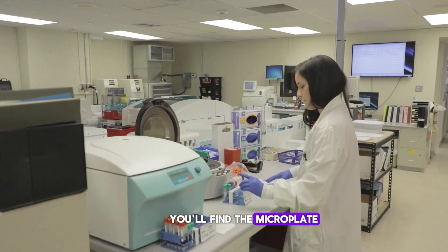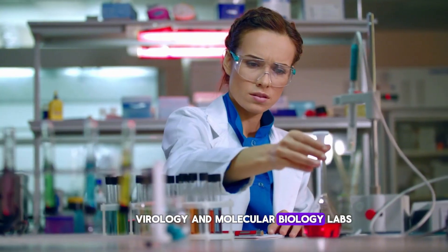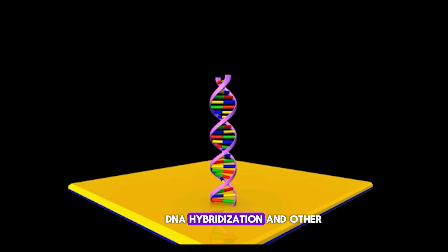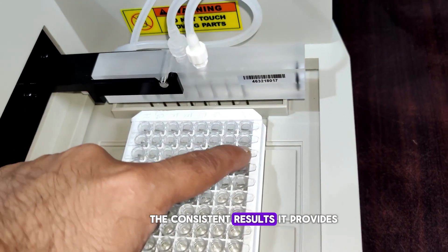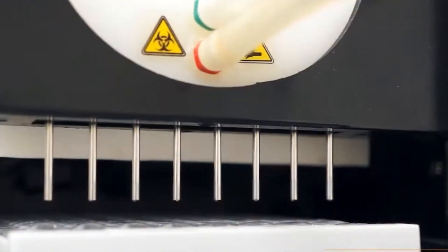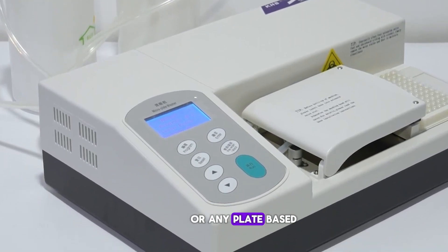You'll find the microplate washer in many immunology, virology, and molecular biology labs, helping scientists perform protein binding assays, DNA hybridization, and other crucial experiments. The consistent results it provides are a game changer for experiments that require high sensitivity and specificity. So the next time you run an ELISA or any plate-based assay, remember how the microplate washer works behind the scenes to ensure you get reliable, repeatable results.